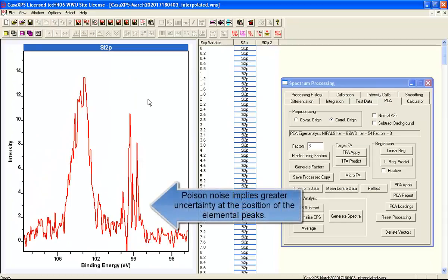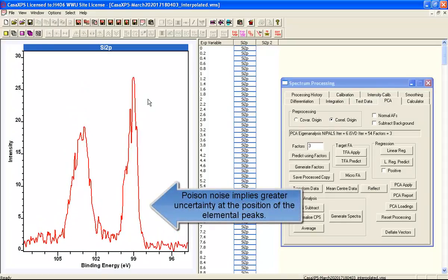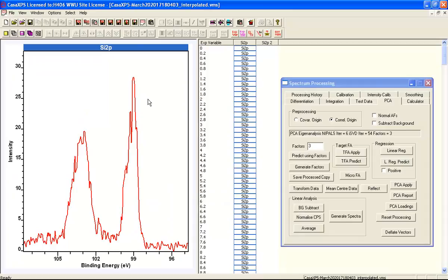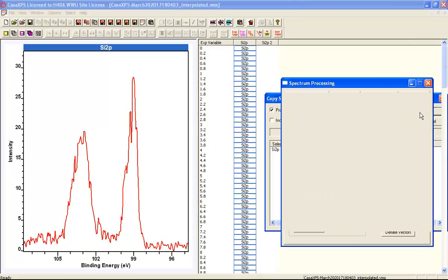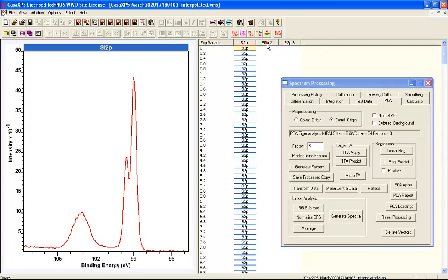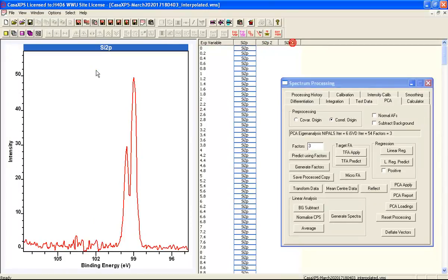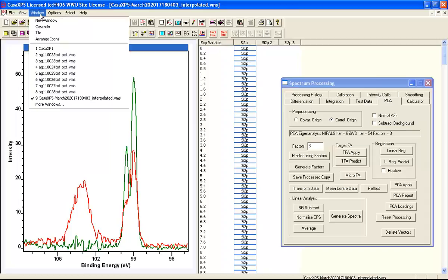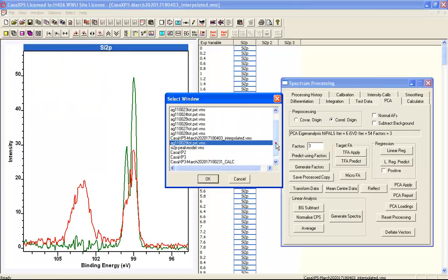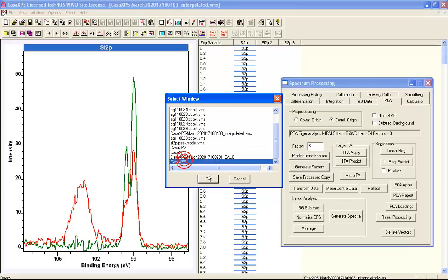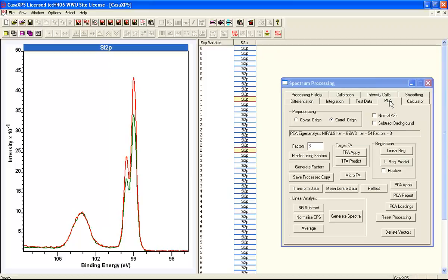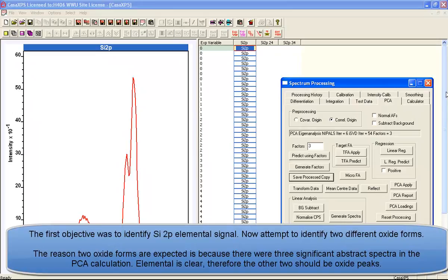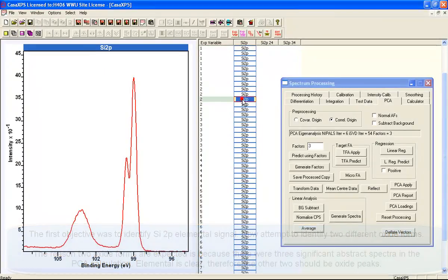Within this same calculation there is evidence of the oxide peak that is much more intense compared to the elemental peak. You'll notice the elemental peak looks relatively noisy compared to the oxide, and that's because of Poisson statistics — you would expect to see a lot more noise around the elemental peak than the oxide. We'll copy these two and put them back into the file that we had constructed, which contains the PCA-enhanced spectra that have all been energy calibrated.